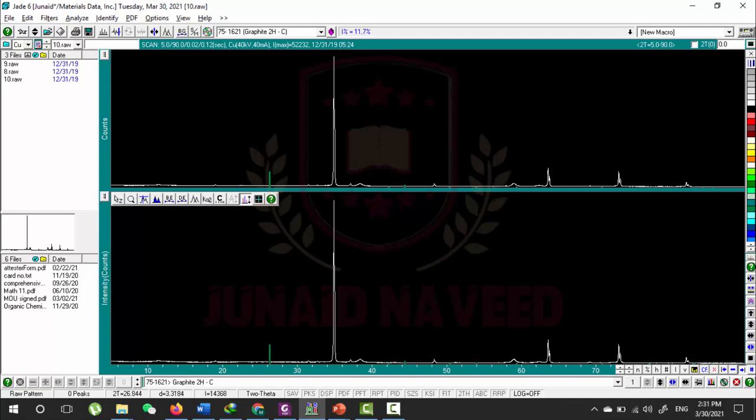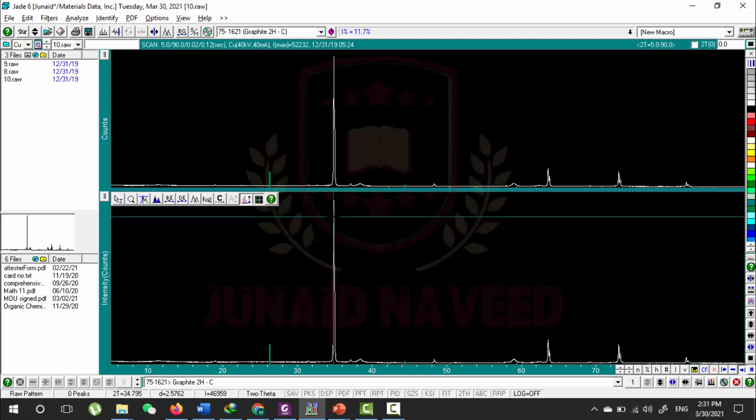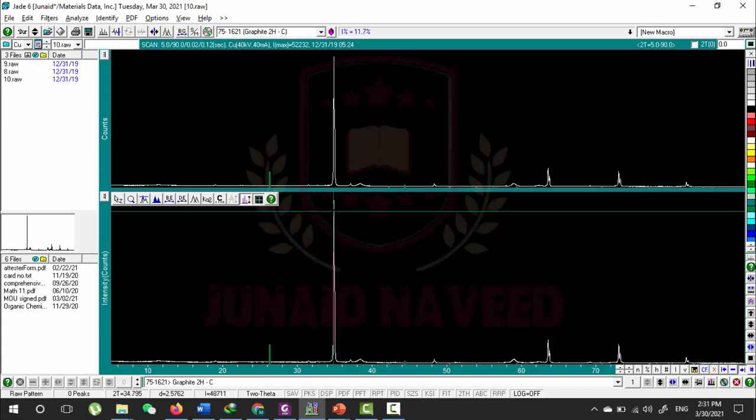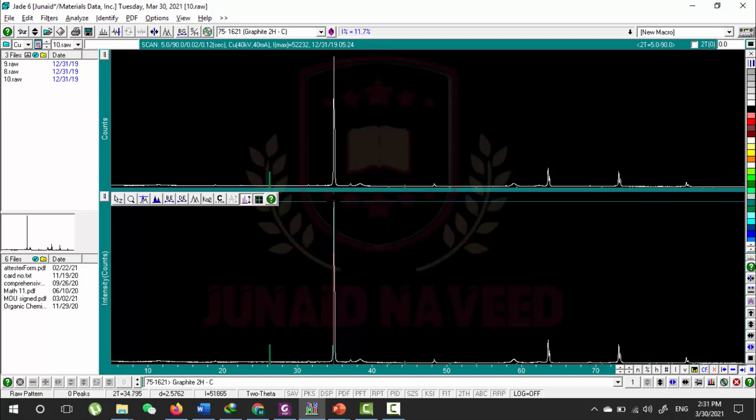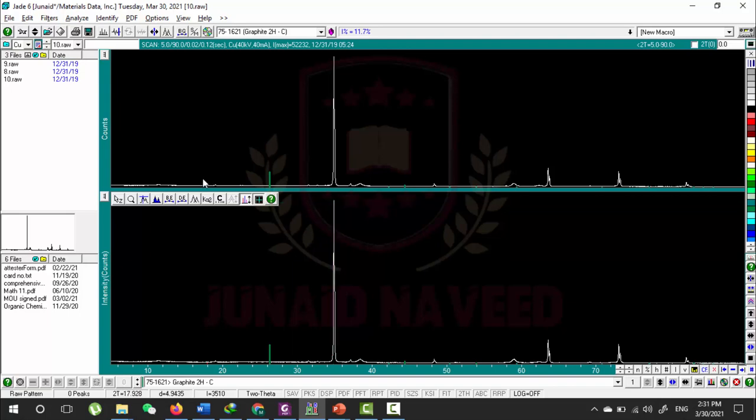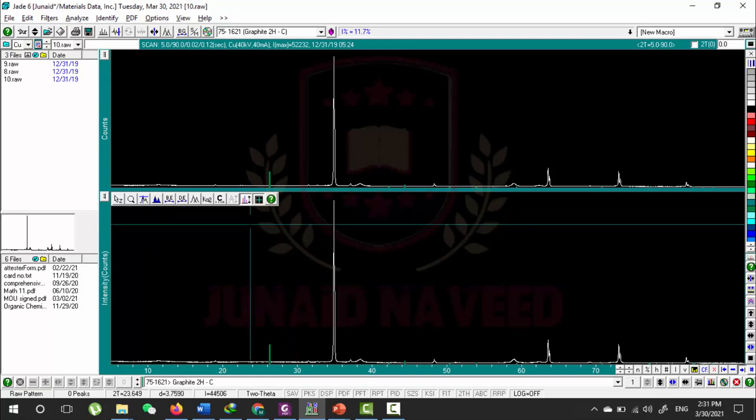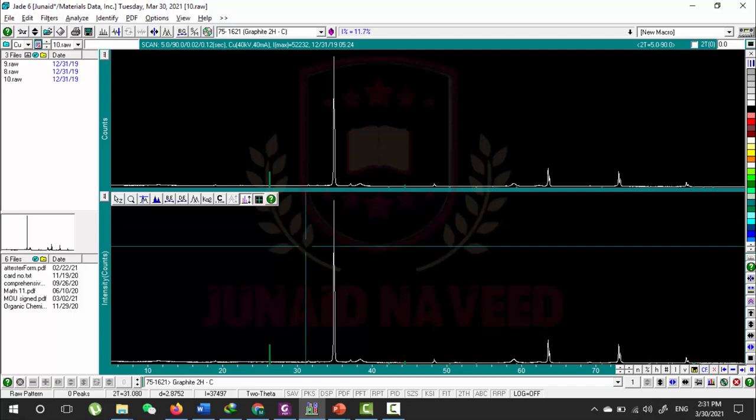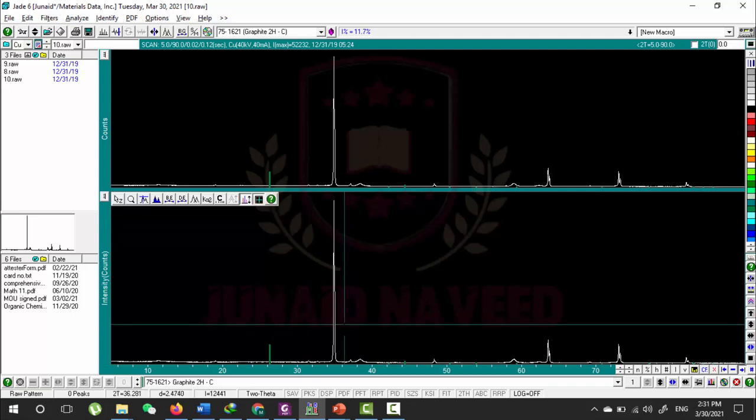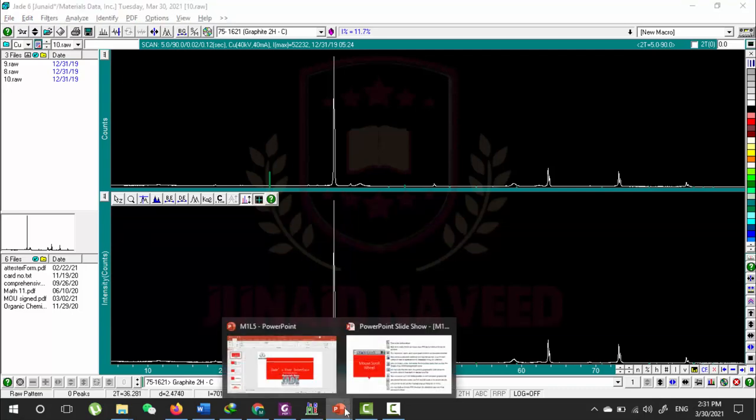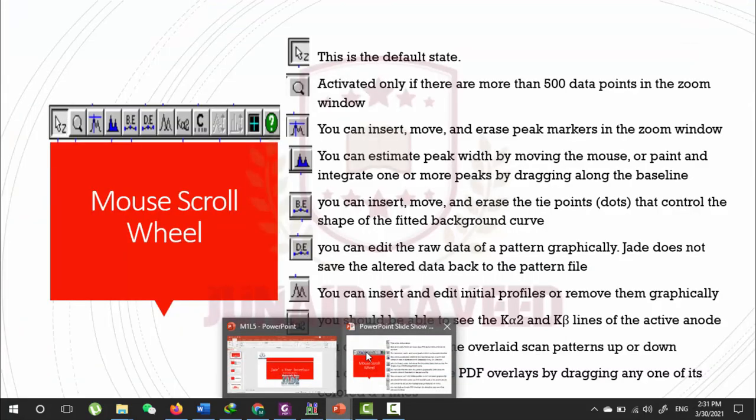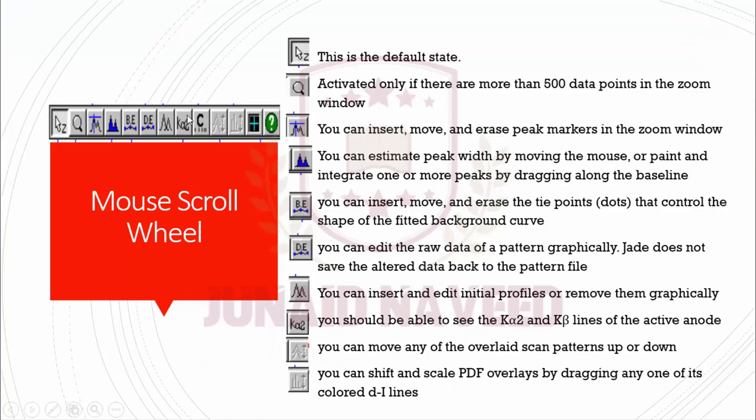I hope you understand the function of this button. The last option is Long Crosshair. It shows the different values on the x-axis and y-axis, so it is easy for you to locate the two theta value and different values in the main pattern. You can see where it is lying and then make different calculations according to your research.